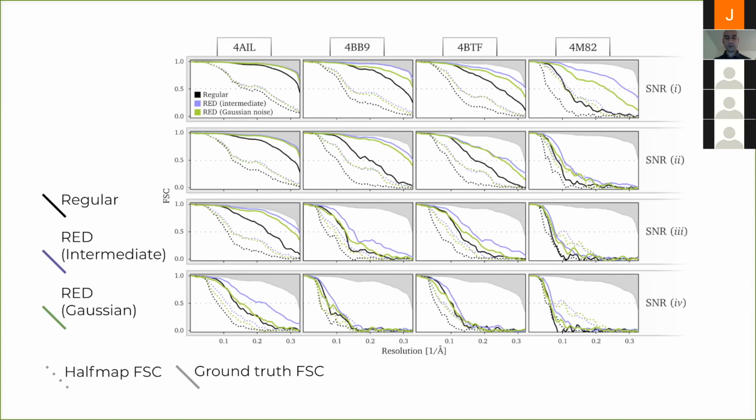There are these dual approaches where you reconstruct in Fourier space, then go to real space and do solvent flattening, or do something in real space and then go back to Fourier space, and you do this iteratively. Those kinds of approaches limit application of neural networks because it's very difficult to plug into the heart of the algorithm, since it's done in Fourier space.